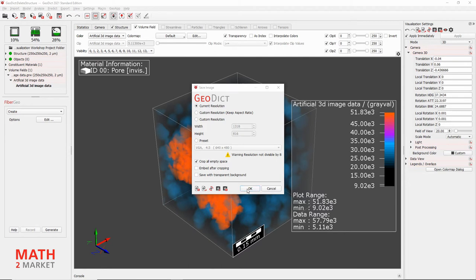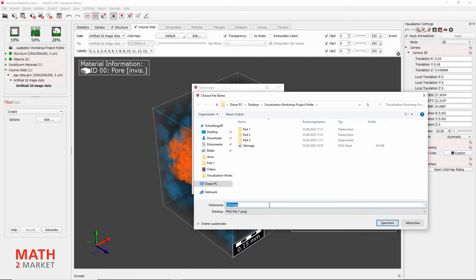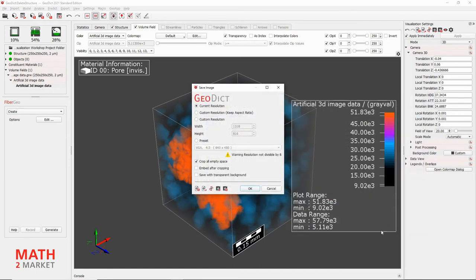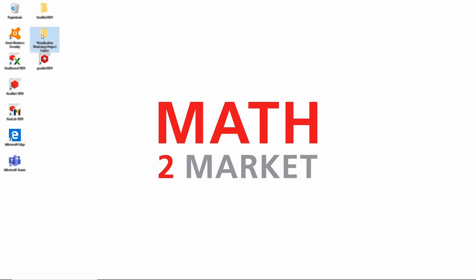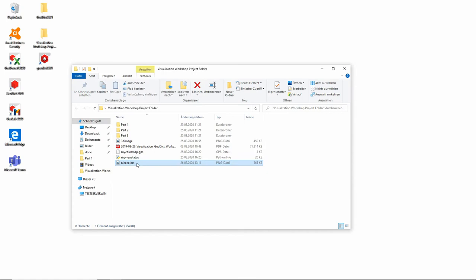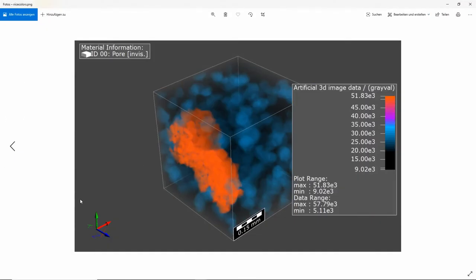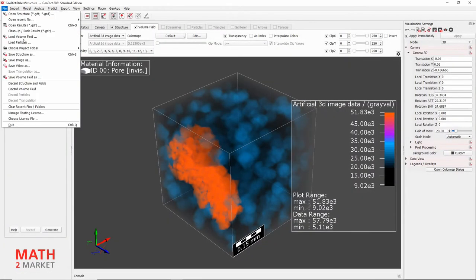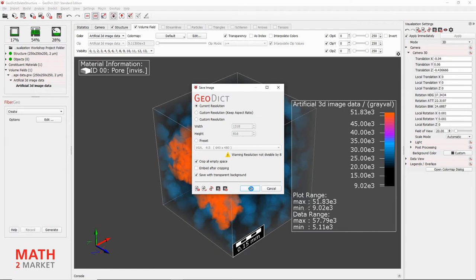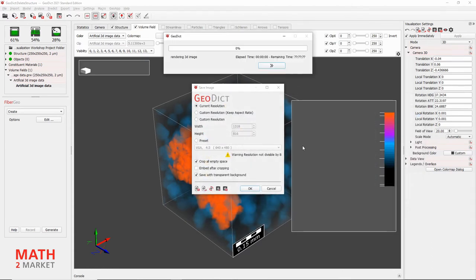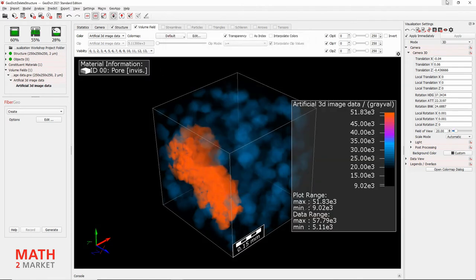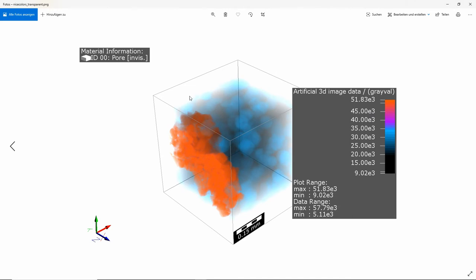We will keep Crop All Empty Space and deselect Save with Transparent Background, then click OK. It asks us to save the image — let's just call it NiceColors. For comparison, if we go back to the menu and save the image again selecting Save with Transparent Background, and call it NiceColors_Transparent, we can see in the project folder that the image was saved with a transparent background, which is better for embedding in PowerPoint slides.